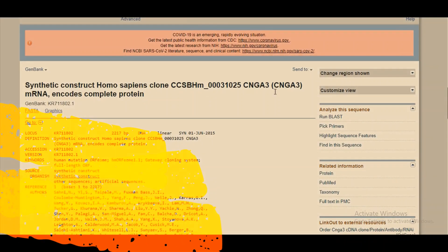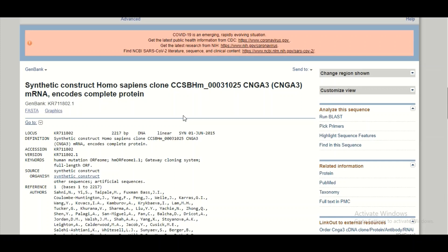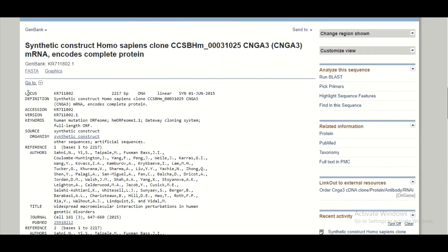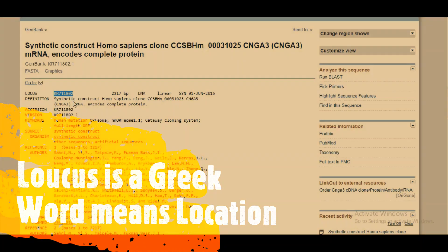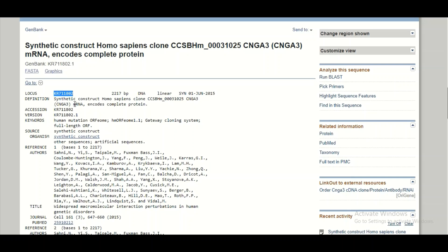This page contains a lot of information about my gene sequence. The first line shows the word 'locus,' which means location. In front of it is the alphanumeric number KR711802, also known as the accession number — a unique identifier assigned to the gene sequence in the database. You can also see the total length of the sequence, whether it is DNA or RNA, linear or circular, and a three-letter code like SYN indicating a synthetic construct, along with the date the sequence was submitted to NCBI.